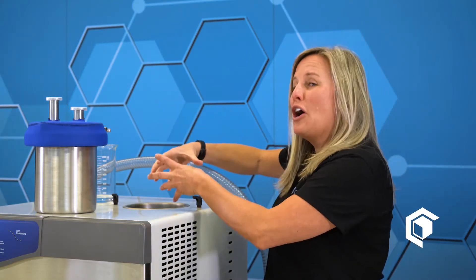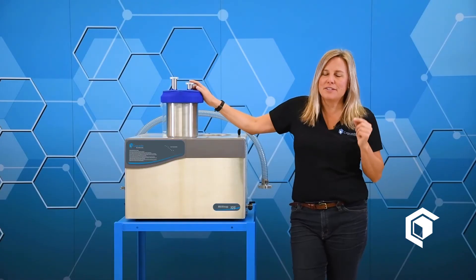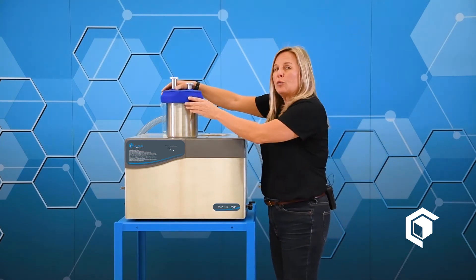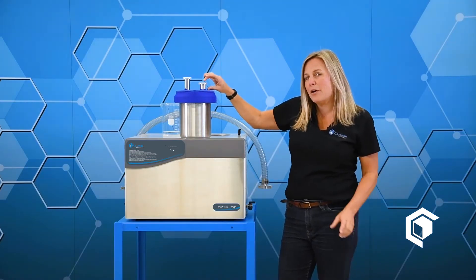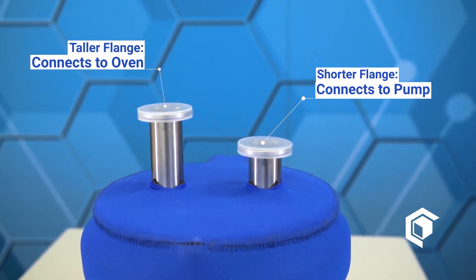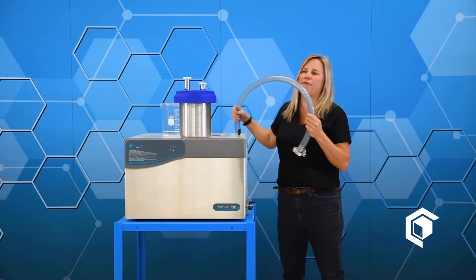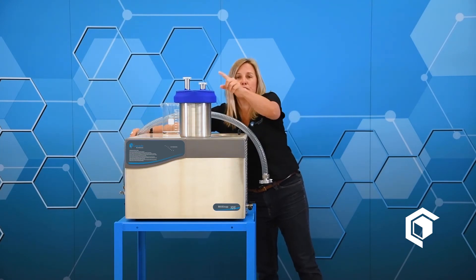Once you have your thermal transfer fluid in the reservoir, insert the cold well into it. This is the most important part of connecting up the max trap. You'll notice on the cold well there is a tall spout and a short little baby spout. The short spout must connect to the vacuum pump. The tall spout goes to your vacuum oven or whatever device has your product that is outgassing the solvent. The max trap comes with four feet of KF25 connection to connect the short spout to your vacuum pump, but if you need a different length or fitting modifications, do let us know.